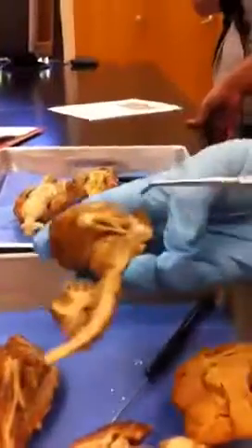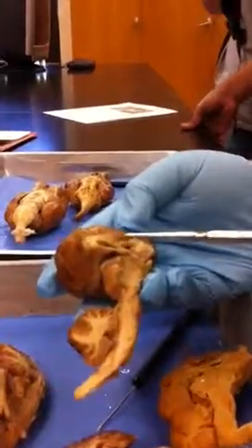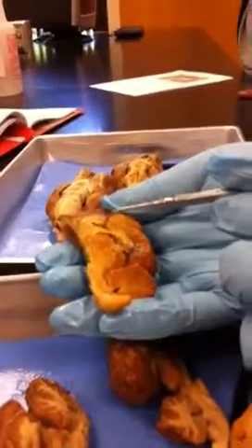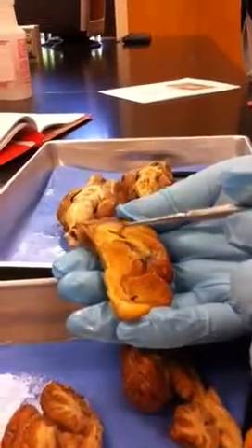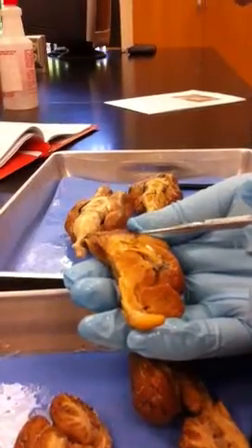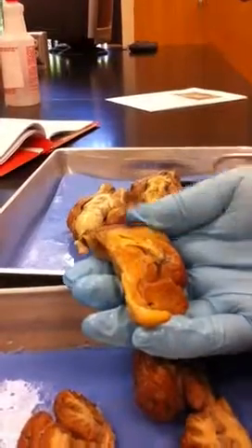On the other hand, the fornix is, let's see, find a better one. Here's a good one. See, here's the corpus callosum, and then the floor of that lateral ventricle is the fornix. So this piece right here is all fornix.